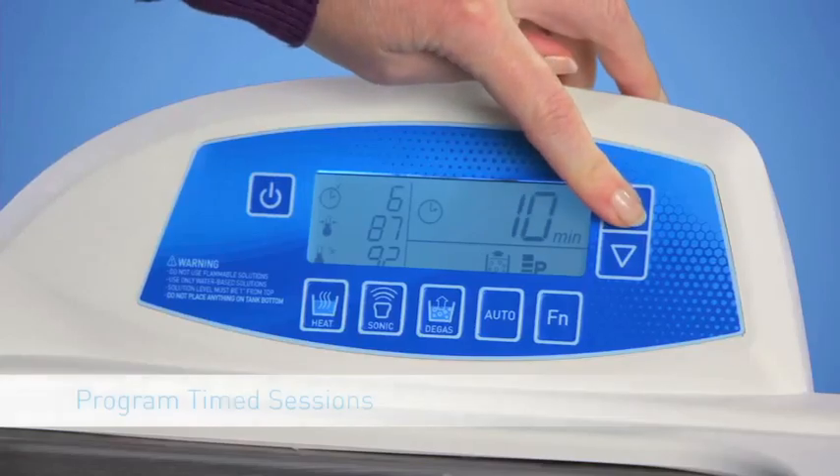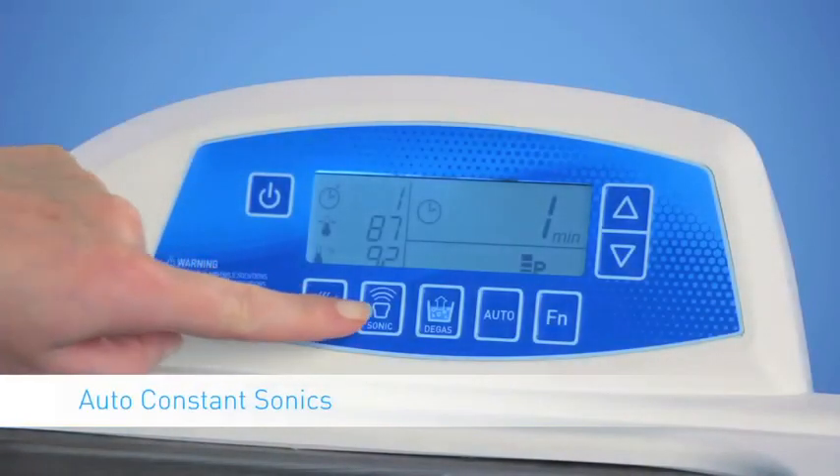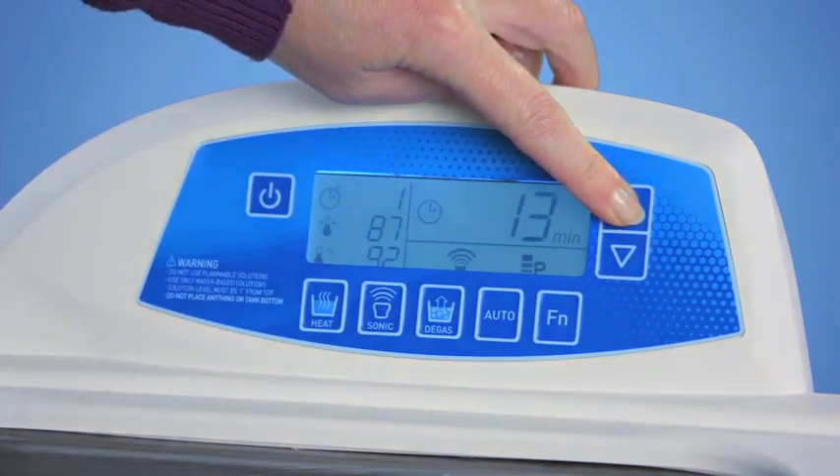Start by setting your cleaning time. You can choose timed increments of up to 99 minutes, or get the flexibility of continuous cleaning with the Constant Sonics mode. Either way, just set your digital Bransonic and forget it.